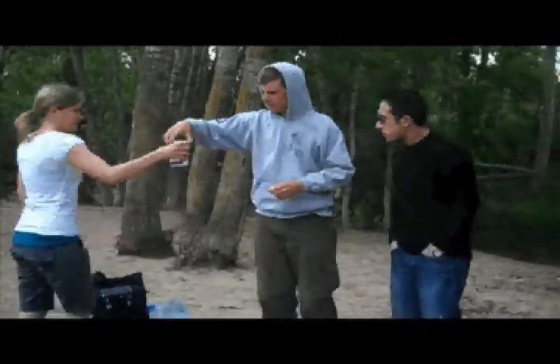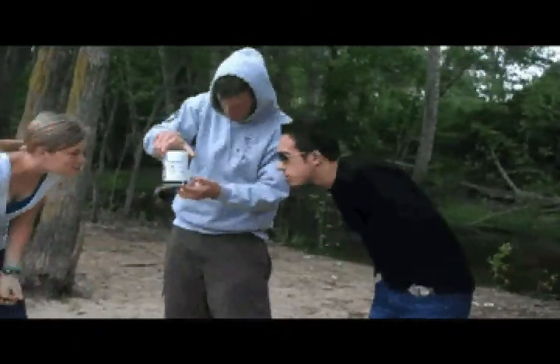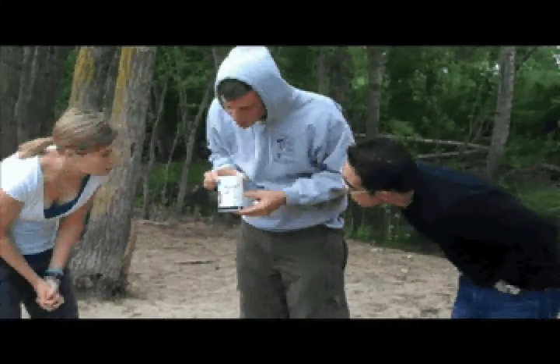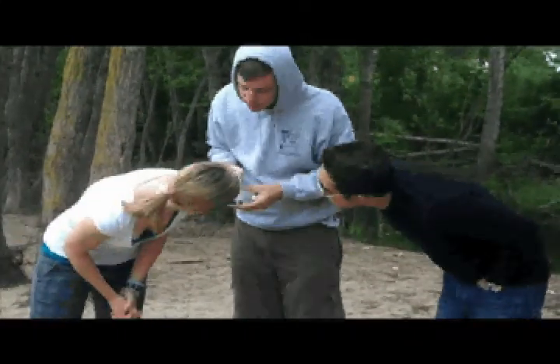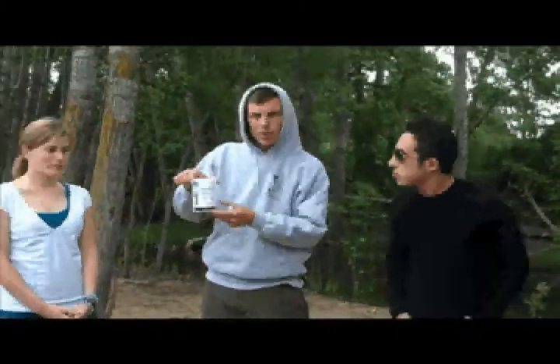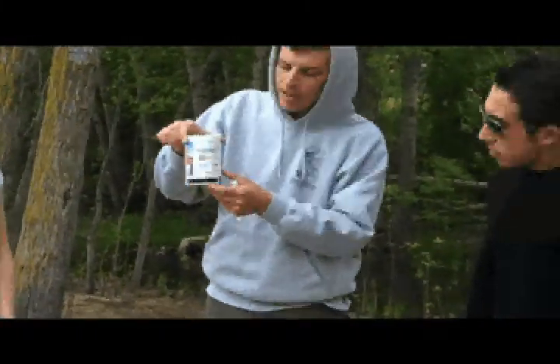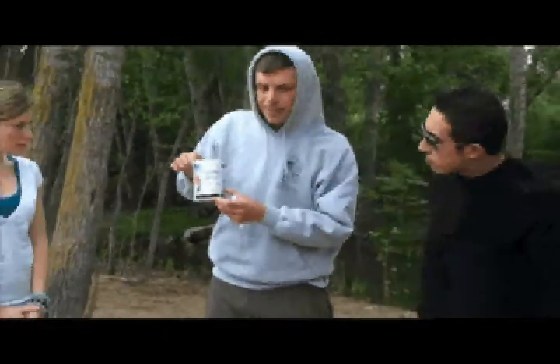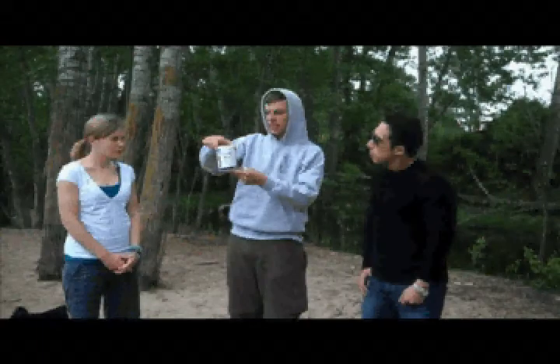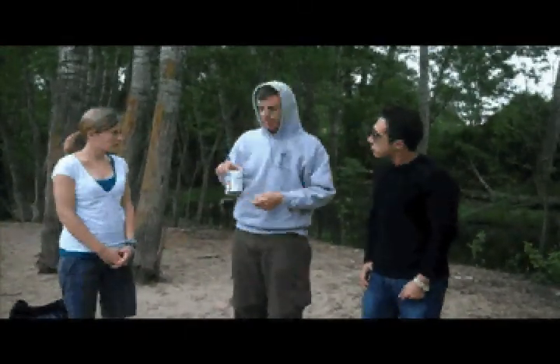Okay, so let's take a look here and see. Look at the front. What looks to be the clearest number you can read? 6. Okay, so if you look real close, can you zoom in on that there? You'll see that the 6 is the darkest, clearest number you can read, and the 8 is the next. So it's going to be between 6 and 8 degrees, I believe. I'm not sure if it's Celsius or Fahrenheit. I'll have to look that up and find out.